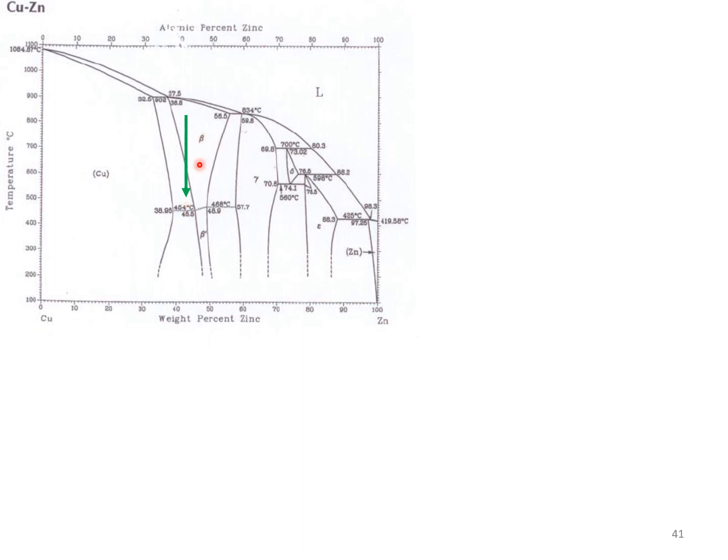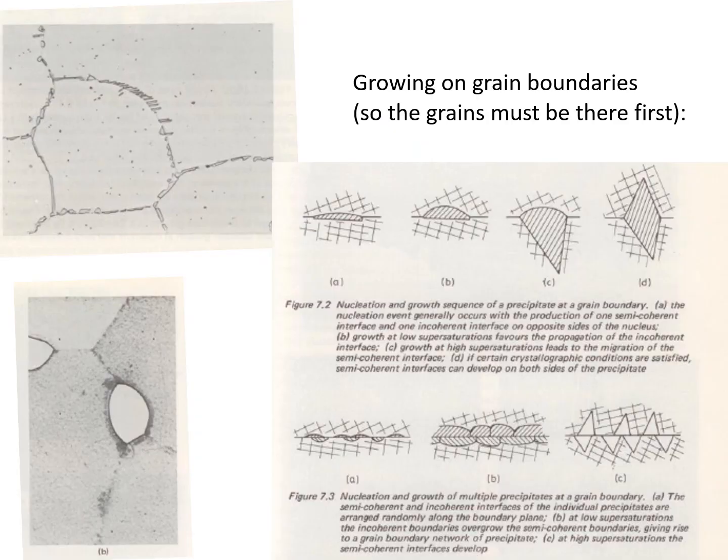This just shows something similar, and what's happening here is you're going from one phase to two phase. And now we haven't got a eutectic at higher temperatures. So now we've got precipitation of that second phase. Okay, and if it's highly saturated, i.e. you're doing it quickly, so there's not enough time for diffusion, you tend to get these needles. Okay, also depends on the interfacial energy. So here you've got straight interface in that grain and curved interfaces in that grain.